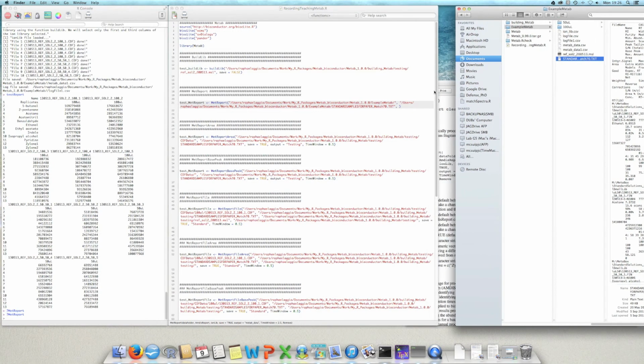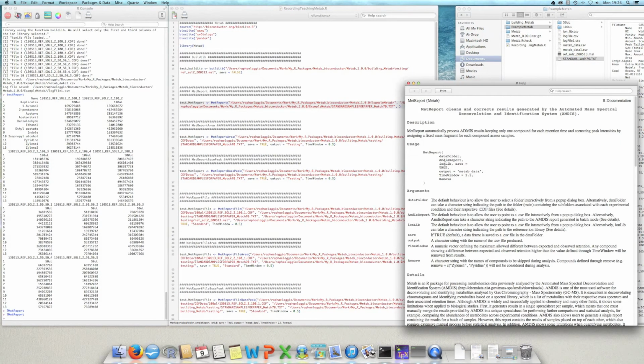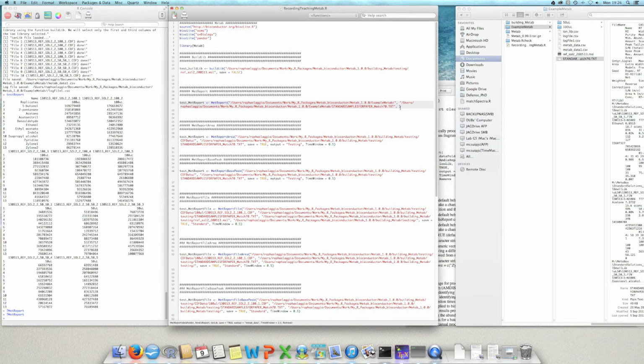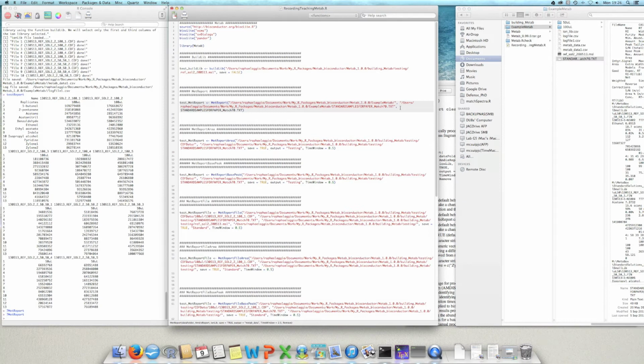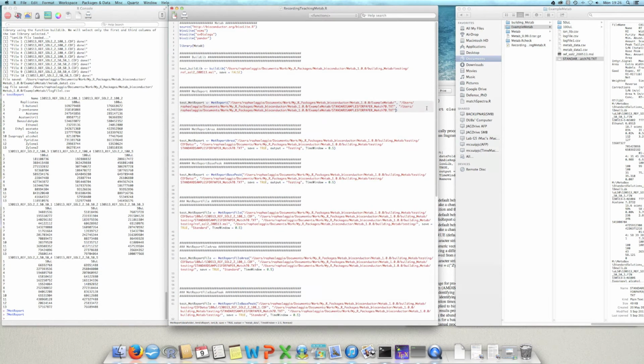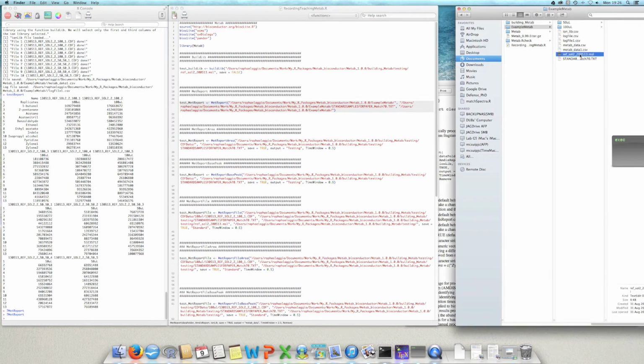Now it's asking me where is the ion library that we are going to use. So the ion library again is in the same folder, however it's a different file, so I can copy and paste and just change the name of the file. I can choose the MSL file or the ionlib, doesn't matter, any one is going to work. So that's the file.